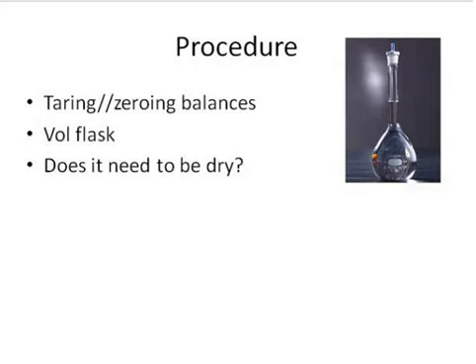You want to put it about half full with water and the sugar, and get the sugar to dissolve in the water before you start filling up into this part where it's very difficult to get a lot of movement of liquid. And then the other thing is when you start filling this neck part, it fills much more rapidly than it does down here. And so when you get within a couple of inches of the line, you should do that last bit of filling with an eyedropper so that you're very careful about sneaking up on the line, because if you blow past the line, there's no way to take the volume out and get an accurate measurement, so you have to dump the whole solution and start all over again, which is really time-consuming and painful.